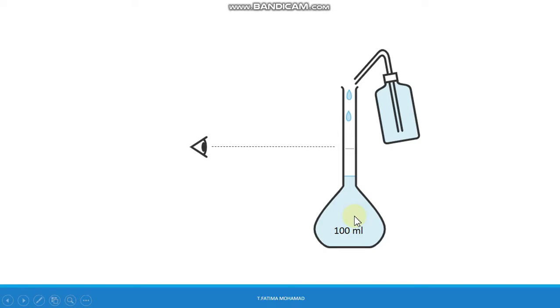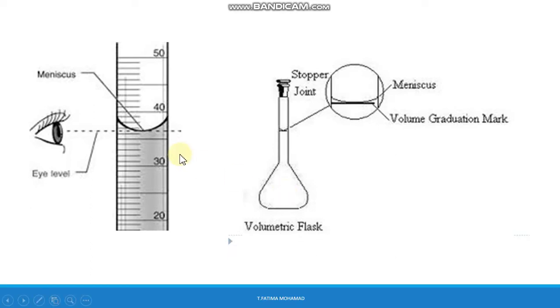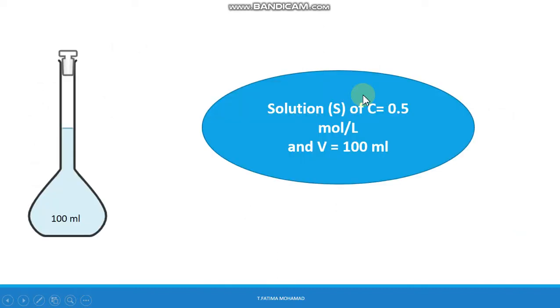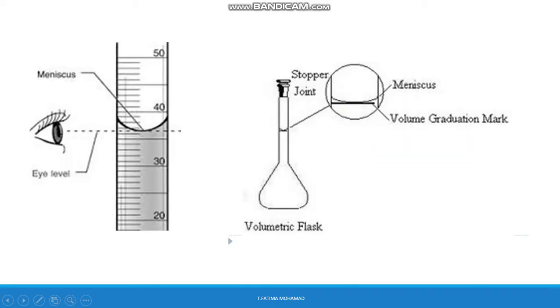To correctly read the line mark, your eye level should be at the meniscus. The meniscus is the lowest point of the surface of the liquid. The line mark should be directly below the meniscus of the solution. After adding water to the line mark, shake the flask well to homogenize the solution.